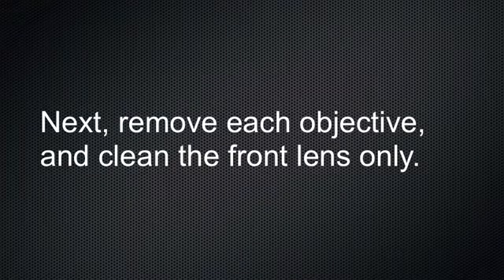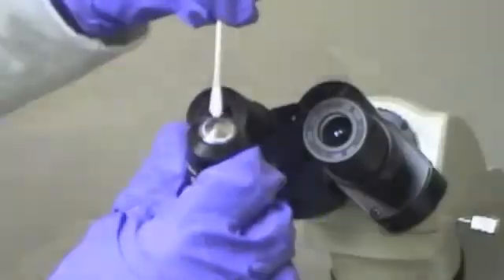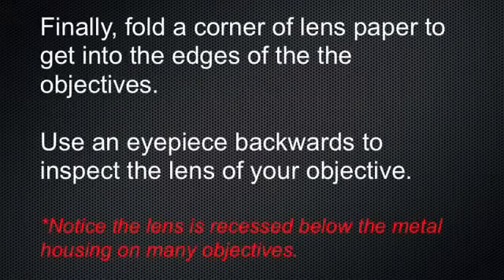Next, remove each objective and clean the front lens only. Add a drop or two of lens cleaning fluid to a cotton-tipped applicator swab. Begin cleaning in the center of the objective using a circular motion toward the outer edge. A drop of lens fluid onto lens paper works well too. Finally, fold a corner of lens paper to get into the edges of the objectives. Use an eyepiece backwards to inspect the lens of your objective.